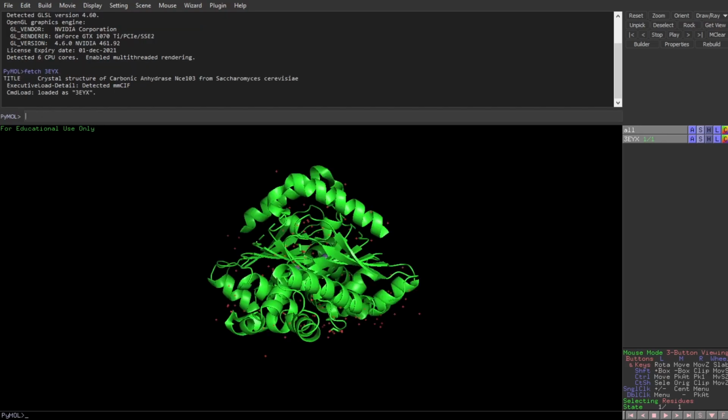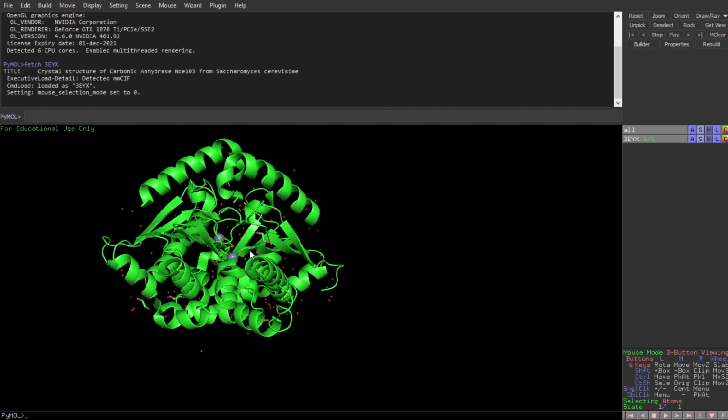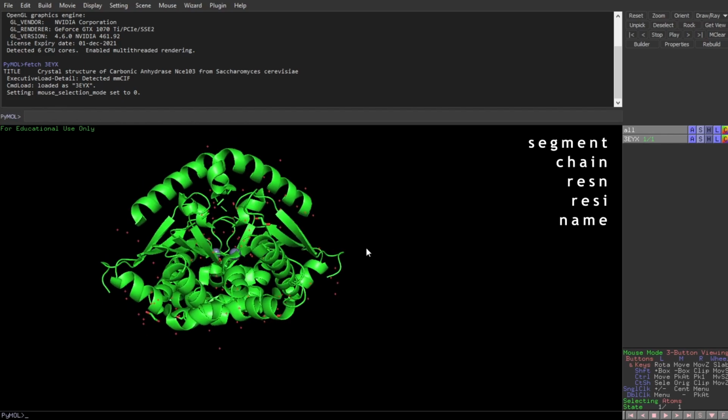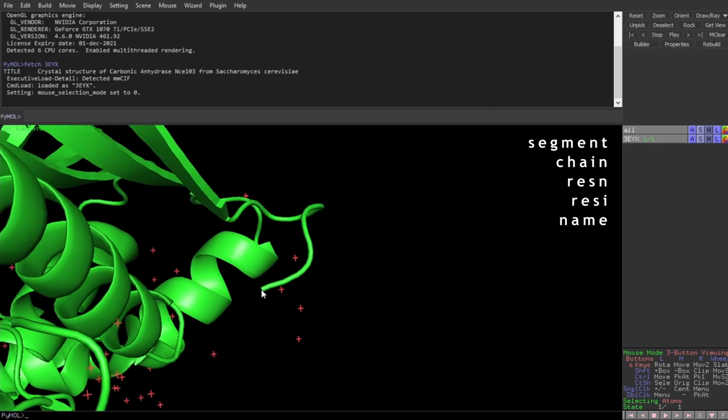But what information does the PDB ID actually contain, and how is it read by the PyMOL program? Simply put, a structure file contains a list of points or atoms which has a x, a y, and a z coordinate. By calculating the distance between the points, the PyMOL program decides if the bonds are covalent or not, and in this way the structure is built in this session. The most important selectors, which all atoms have, are segment, chain, resn, resi, and name.